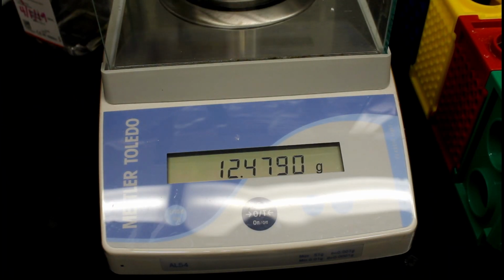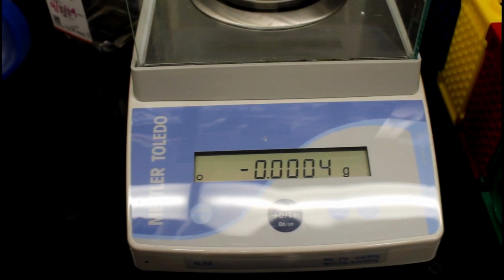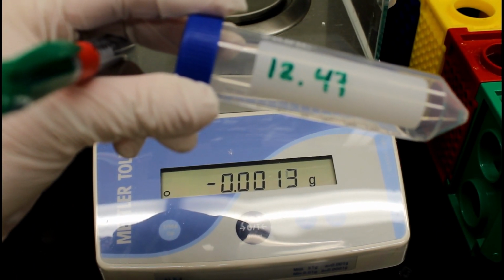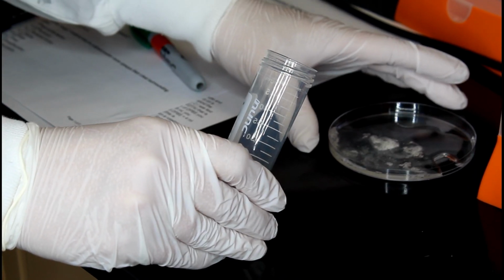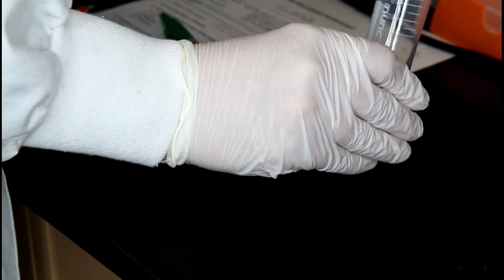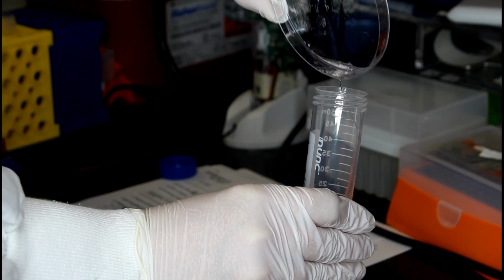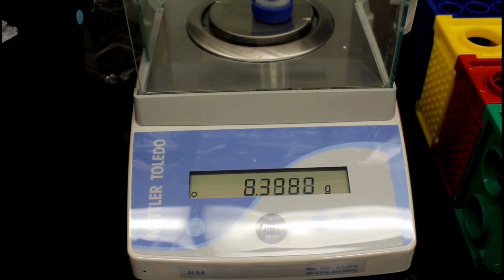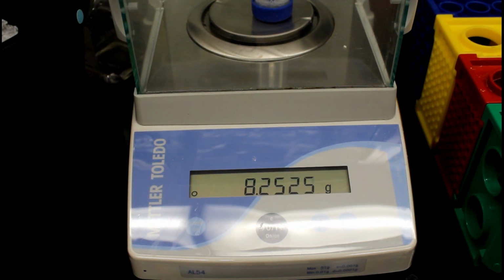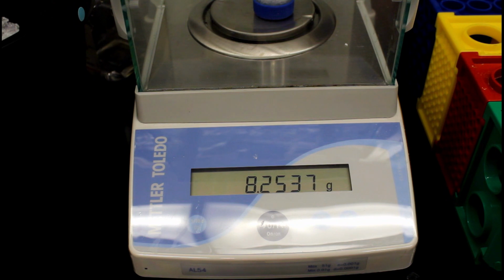Weigh an empty 50 ml tube with its lid and record the weight on the tube. Zero the balance or the scale. Next, pour the entire sample into the 50 ml test tube. Measure the weight of the sample on your scale. Once you determine the weight, put the sample back in the ice bucket.